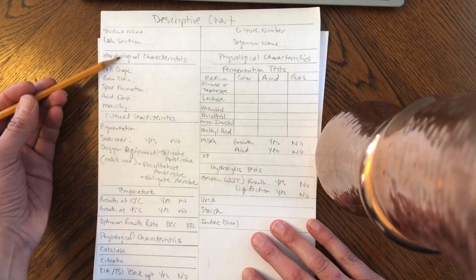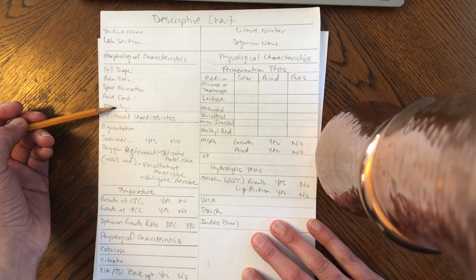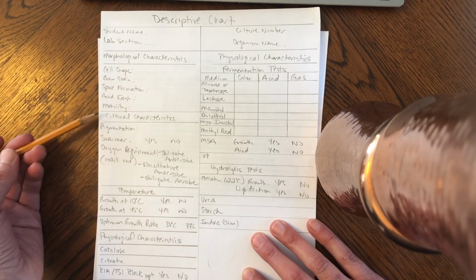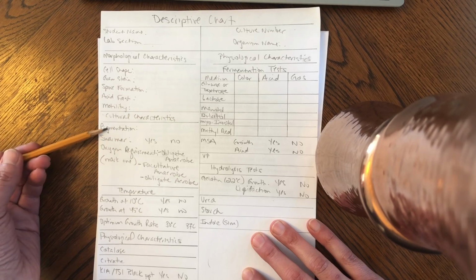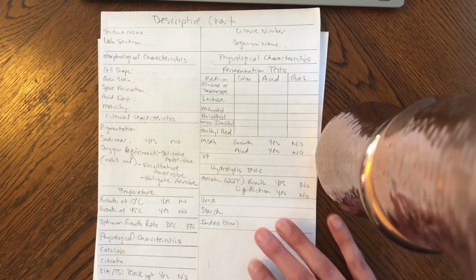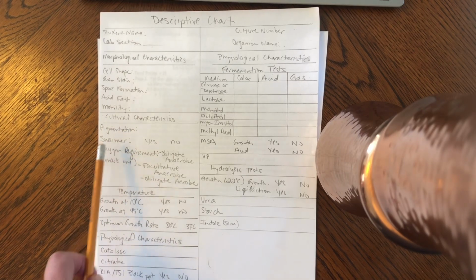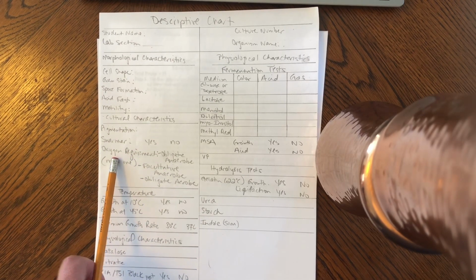So you've got the morphological characteristics already taken care of. You did this in the first section of the lab where we did the slides and stuff. So we need to talk about cultural characteristics. Depending on your unknown number, these cultural characteristics will be different. I have already typed up what I called Unknown Report Addendum, where you will find this information, because depending on what your unknown number is, these different categories will be different for you.